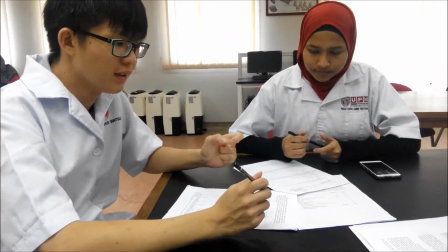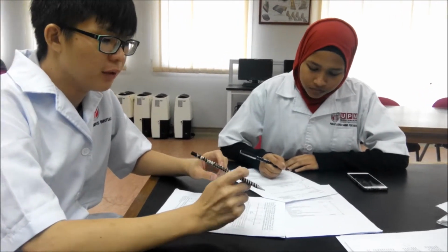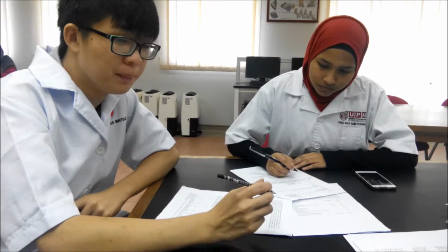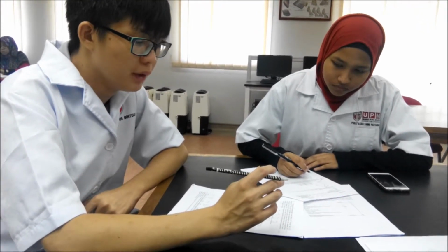Okay, for the next step, the microcentrifuge tubes labeled 0 degrees Celsius enzyme and 0 degrees Celsius substrate will be placed inside an ice cup. And the rest of the tubes will be placed at their respective temperatures and allowed to equilibrate for at least 5 minutes.